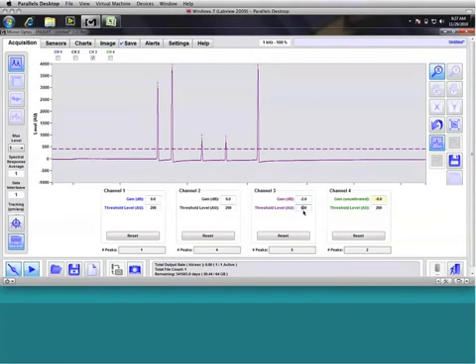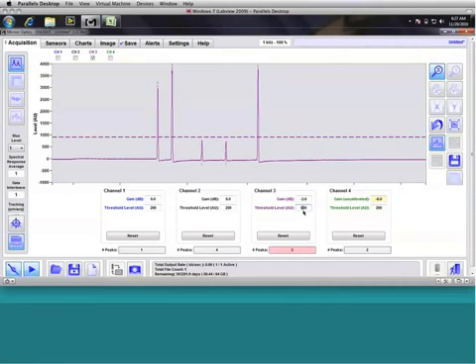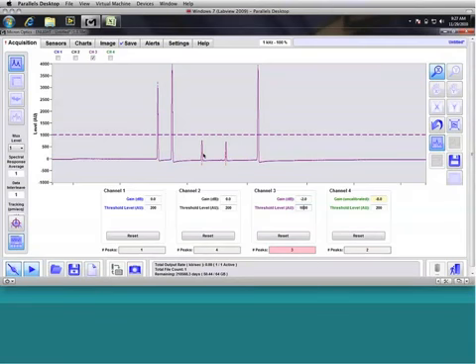As I change that threshold, you see the dashed line, which is the effective threshold, increase. Okay, and now at 1,000 counts, you'll notice that the 2 center peaks have fallen below our threshold and are no longer detected by the instrument. So again, we have a wavelength tracking fault. The interrogator is only detecting 3, but indicates by our 3 red indicators that it was expecting a number other than 3. Additionally, we see a dashed vertical line where the last location in which ENLIGHT was aware that these spectral peaks were reported.